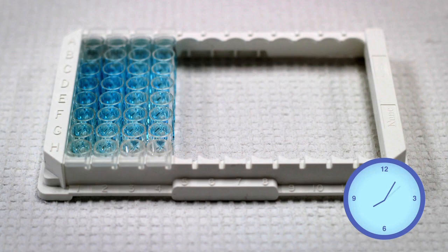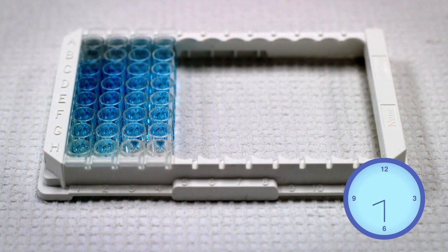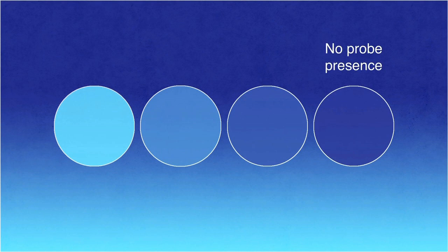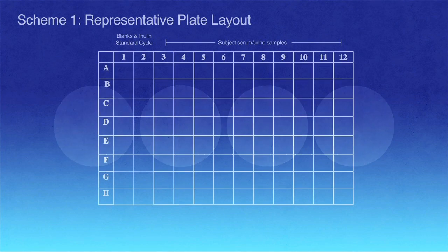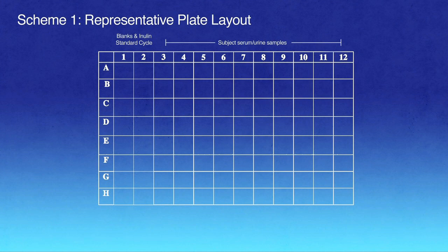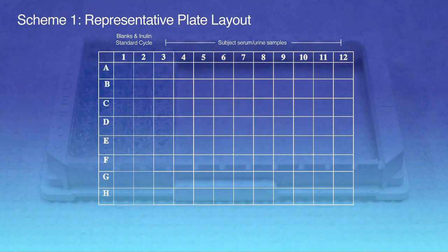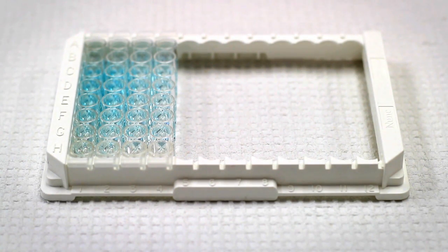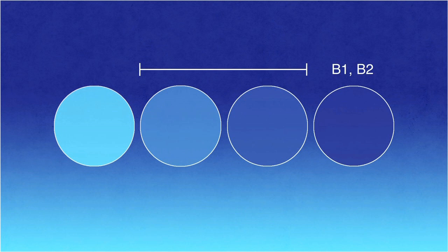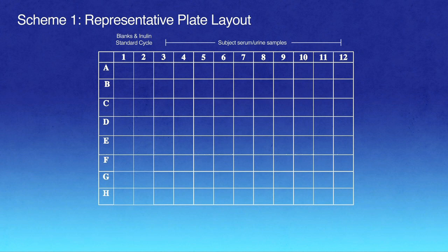As time begins to pass, you will notice that there is a gradation in color for the calibration standards. If there is no probe present in the sample, a deep blue color will begin to form. If the concentration of the probe in the sample is too high, it will remain clear with no blue coloring. As a result, wells B1 and B2 show the darkest blue, and wells H1 and H2 are the lightest blue. Wells A1 and A2 are clear because no rabbit antiprobe or goat anti-rabbit IgG HRP were added to these wells. As the plate develops, examine your unknown samples. In terms of color, all samples should appear to fall between B1 and B2 and H1 and H2. Make sure to document all useful observations on the schematic of your worksheet.